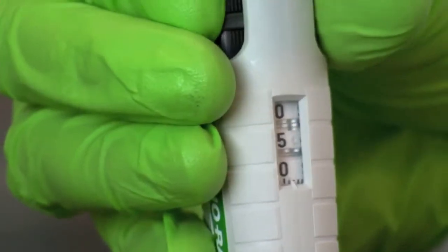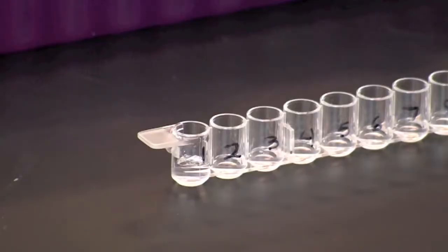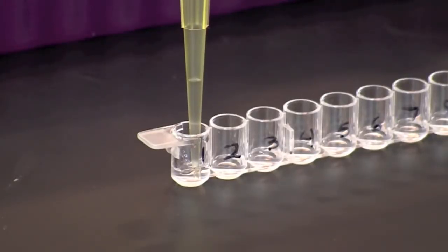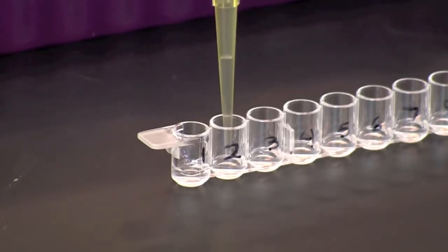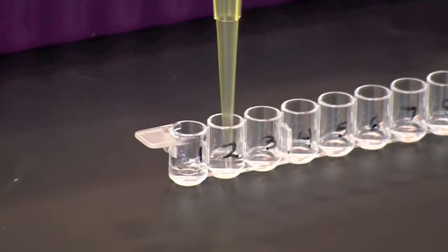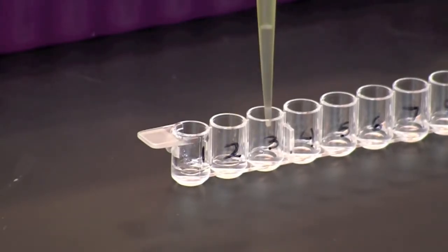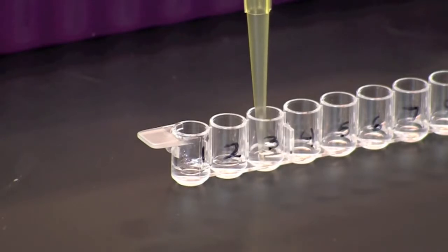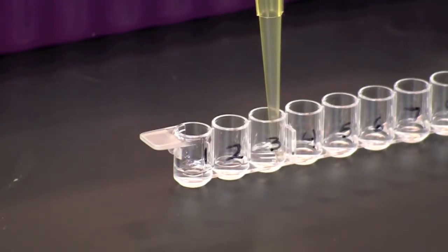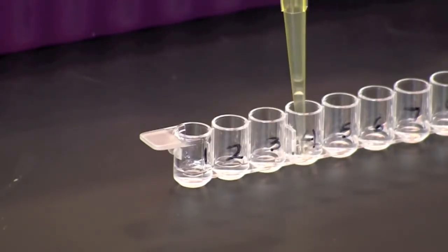First set your pipet to 50 microliters. Pipet 50 microliters out of well number 1 and add it to well number 2. Pipet up and down gently three times to mix the sample in well number 2. Using the same pipet tip, transfer 50 microliters from well number 2 to well number 3 and mix as you did in the previous step. Repeat this transfer and mixing step, moving to the next well each time.